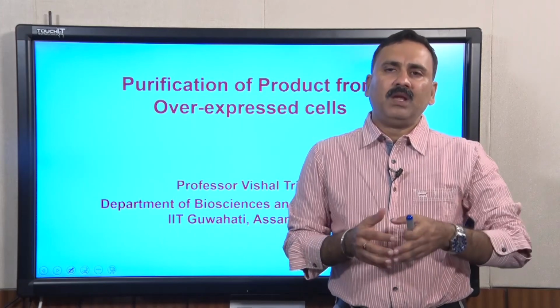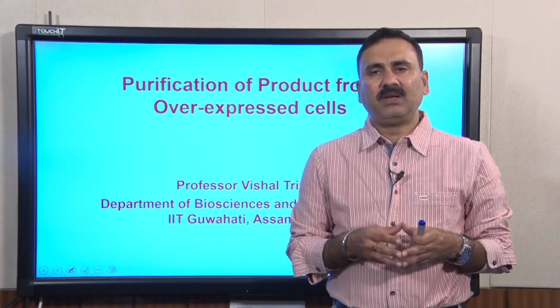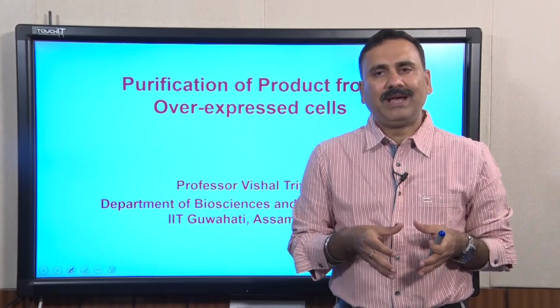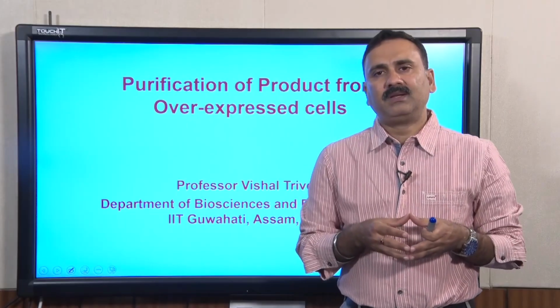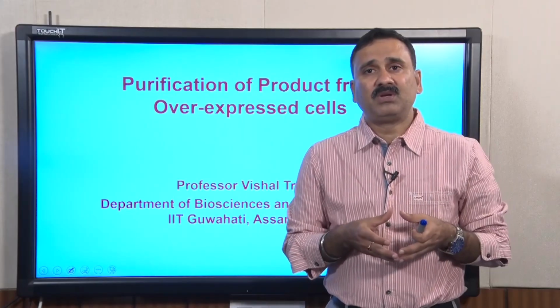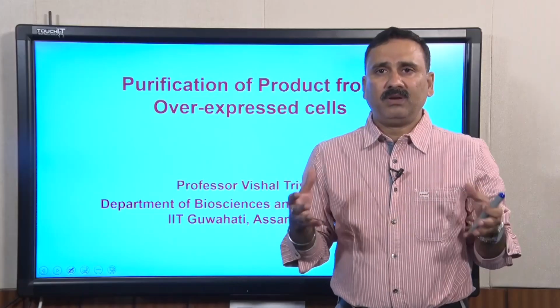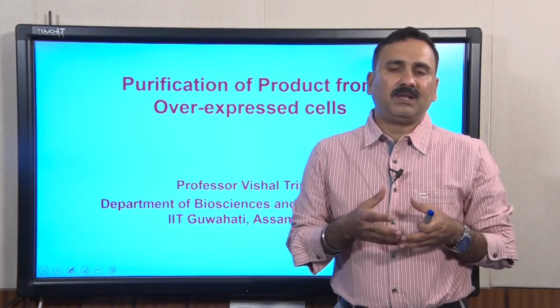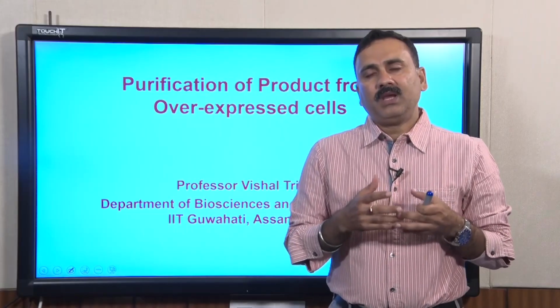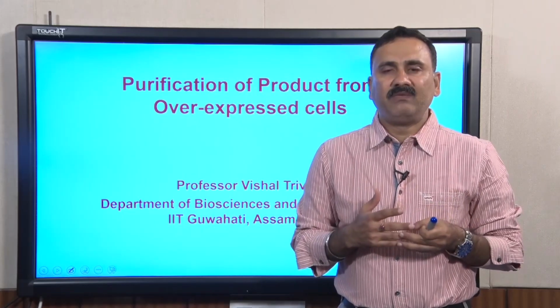In this series, in the previous lecture, we have discussed the basic principle of separation as well as the principle of column chromatography, and then subsequently we have discussed the chromatography system as well as the different components of the chromatography system, their influence on the overall purification efficiency as well as the purification folds, and now in this lecture we are going to discuss the different types of chromatography techniques.